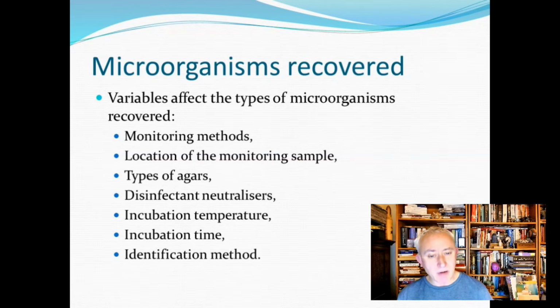There are other factors, such as whether we've got the presence of an antimicrobial, such as disinfectant residues, so we need to have appropriate neutralizers, particularly in surface samples and plates used for finger plates. And we're also going to get variations in recovery depending upon the incubation temperatures, if we're doing dual incubation, the order of incubation, the incubation time, and then also with the identification method, because a number of identification methods are relatively limited. Many have databases that are biased towards the clinical. So we're going to have these considerable variables.